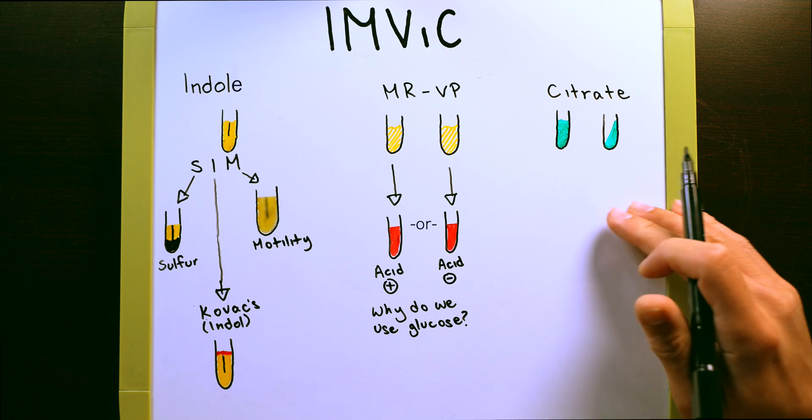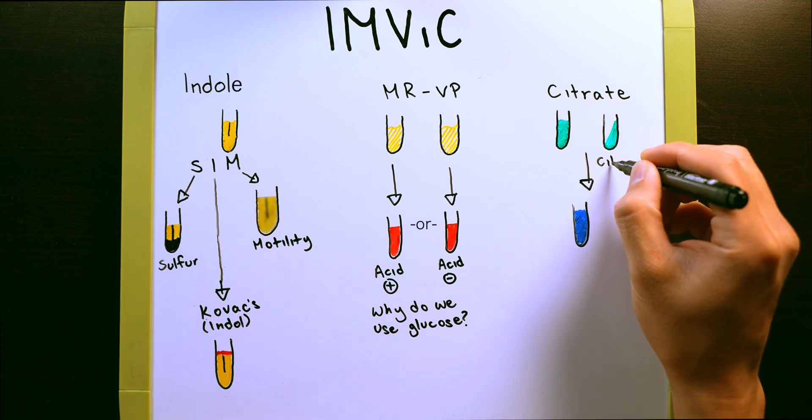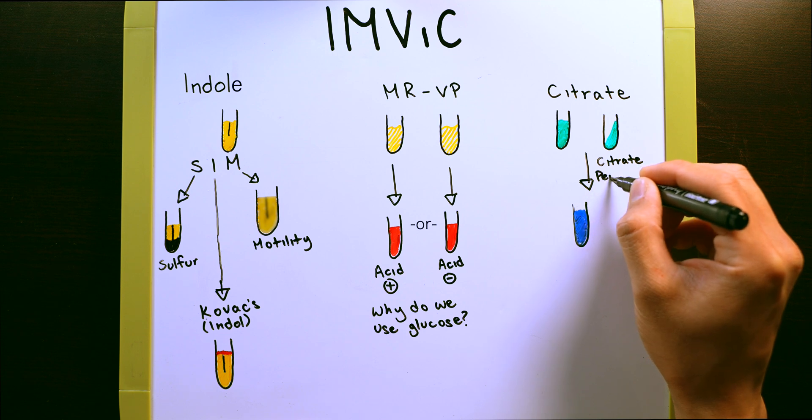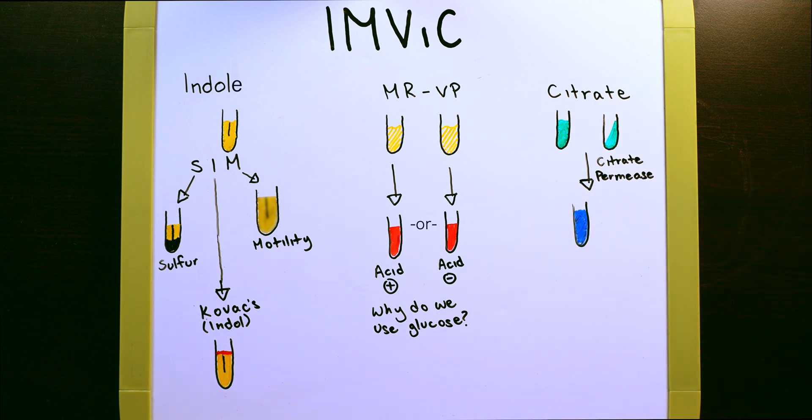Lastly, your citrate test. The citrate test takes virtually no time at all. And all that you're doing here is looking for a simple color change. The color change that you're looking for is from a green to a blue color. And what this means is that the bacteria has the enzyme citrate permease.